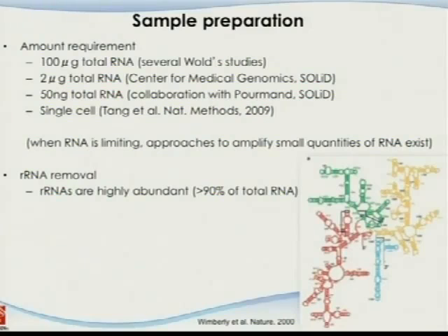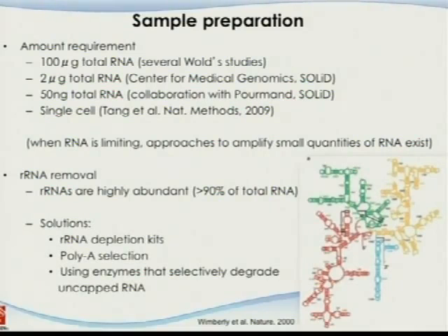Once those meaningful RNAs degrade, the only thing left there is ribosome RNA. That really cost us a lot of money and a lot of trouble to analyze the data. But fortunately we got it through, and we convinced them that ribosome depletion is needed even for small genome bacteria.